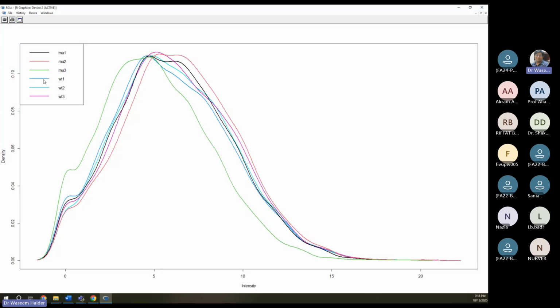The wild type 1, wild type 2, and wild type 3 are a little bit shifted backwards. If you see their right side, they are skewed, with a long tail on the right. Is it a perfect normal distribution? Bell curve? No. Skewed, highly skewed. And this line continues along the axis, right? So most of them are indicating right skewness. The graph is pointing towards the right. Your right, not the graph's right. Okay. Again, I repeat, your right, not the graph's right.